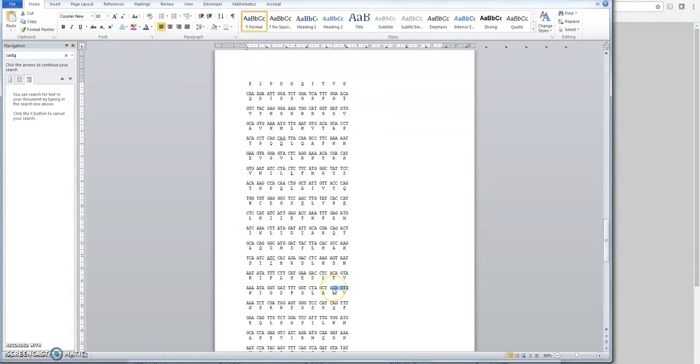So that means that we've now virtually completed part 3. All we have to do now is search for a scientific paper that's got the V600E mutation in it, and hopefully it will contain some sequence that resembles this here, and we'll be able to work out exactly which base is mutated with the V600E mutation, which is what we're looking for.